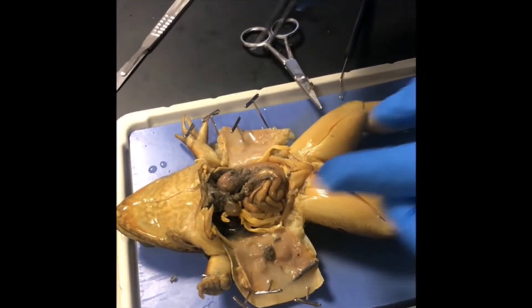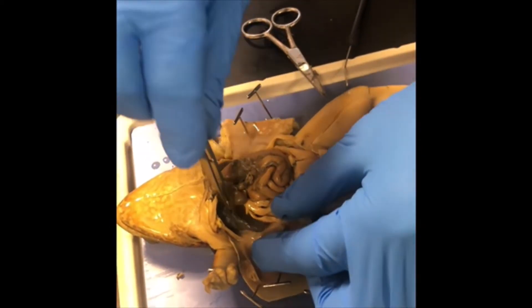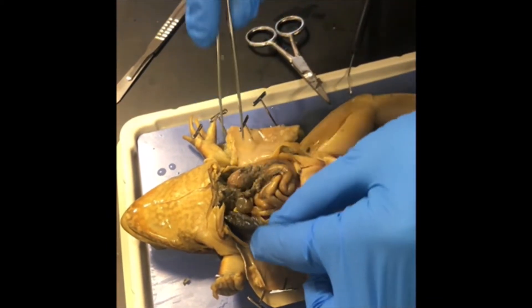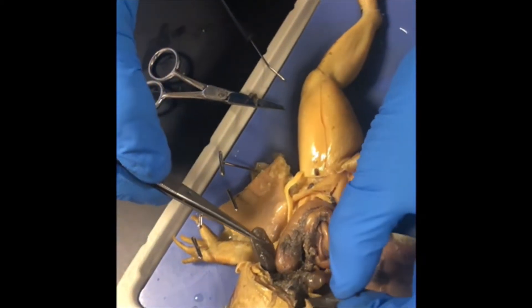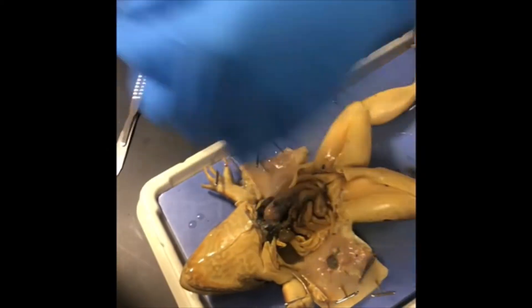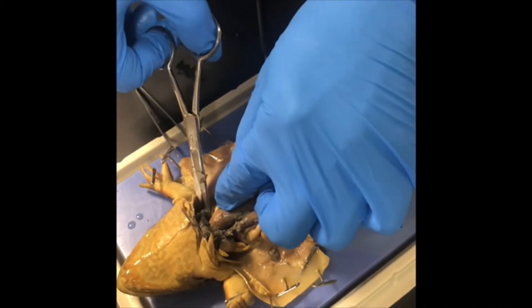Identify the lungs: two small sacs on either side of the midline, partially hidden under the liver. Lung number one kind of slipped behind the organs here, and lung number two on this side also slipped behind the organs. So here are the frog's lungs — one, two.